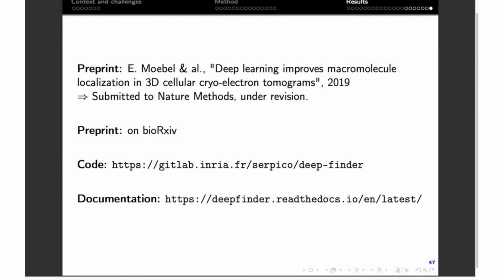Koray asked, the idea of using a spherical mask as ground truth for training in the segmentation problem is interesting. Have you thought about training a model to estimate the sphere center and radius from a patch? For instance, a regression-based model?